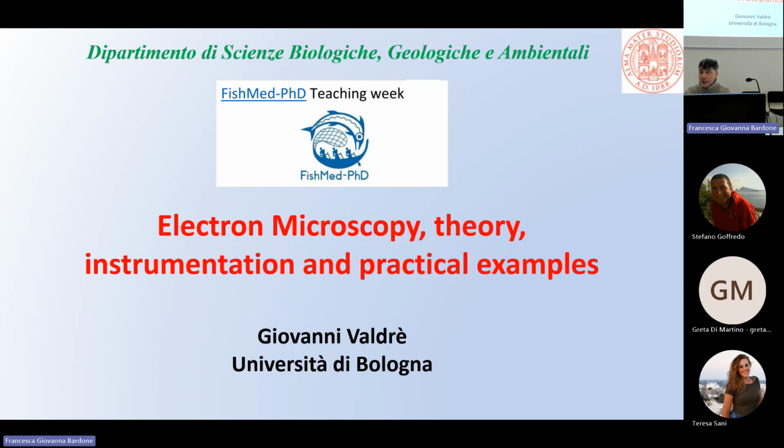I should have 4 hours, but I promise every hour I will take a 5 minute break. So we'll start with electron microscopy: some theory, instrumentation, and examples. I think that with practical examples, the teaching will be much clearer if, after the theory and the technology, you show what you can do with practical examples.